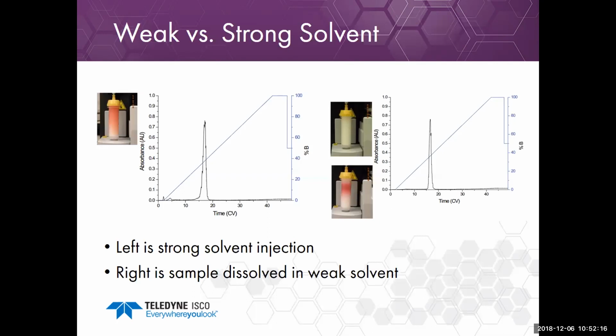If you're running it on the same system, you might want to check your water, check your pH. If you're running a compound that has a polar functional group that is ionizable, that is a carboxylic acid or an amine, I find it best just to use a solvent modifier just to avoid that problem altogether.